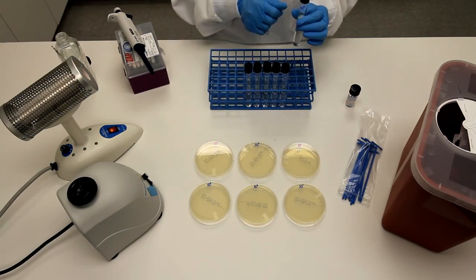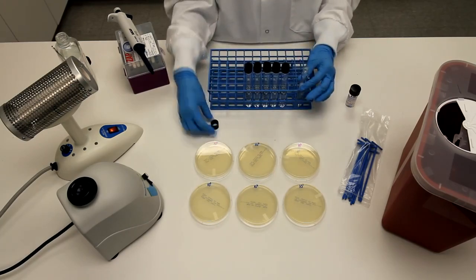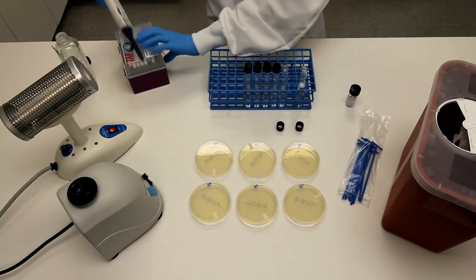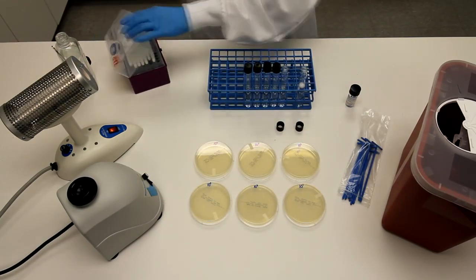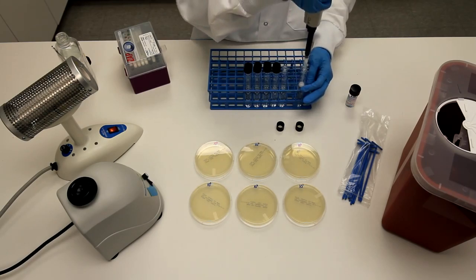Pipet 1 milliliter from the suspension into 9 milliliters of phosphate buffer. Repeat this process until all the tubes have been diluted. Be sure to hold your pipet vertically to achieve maximum accuracy.